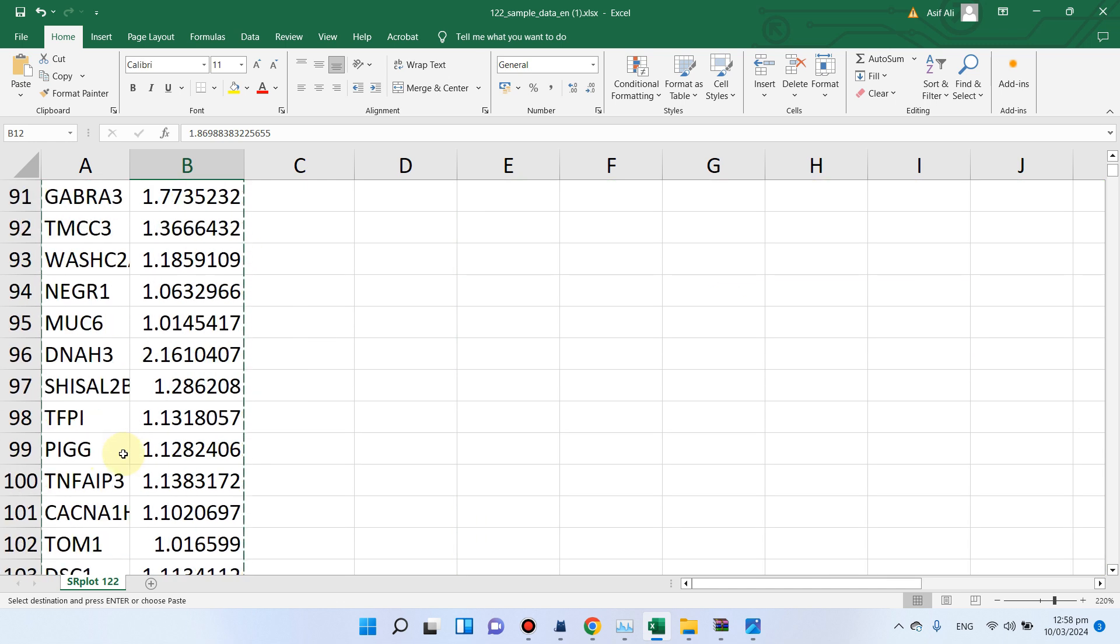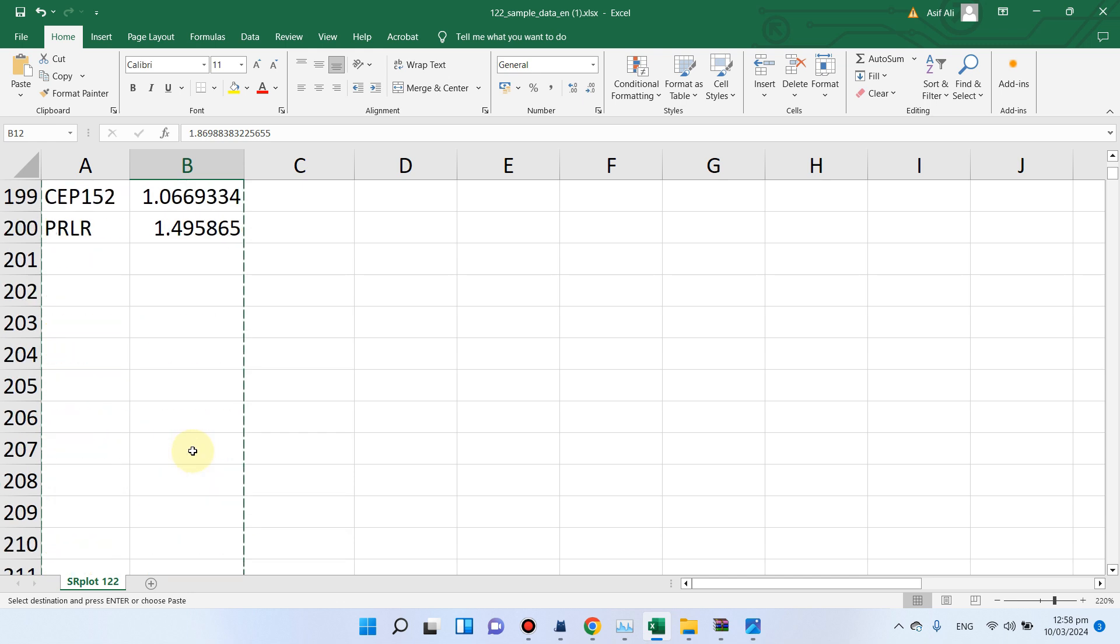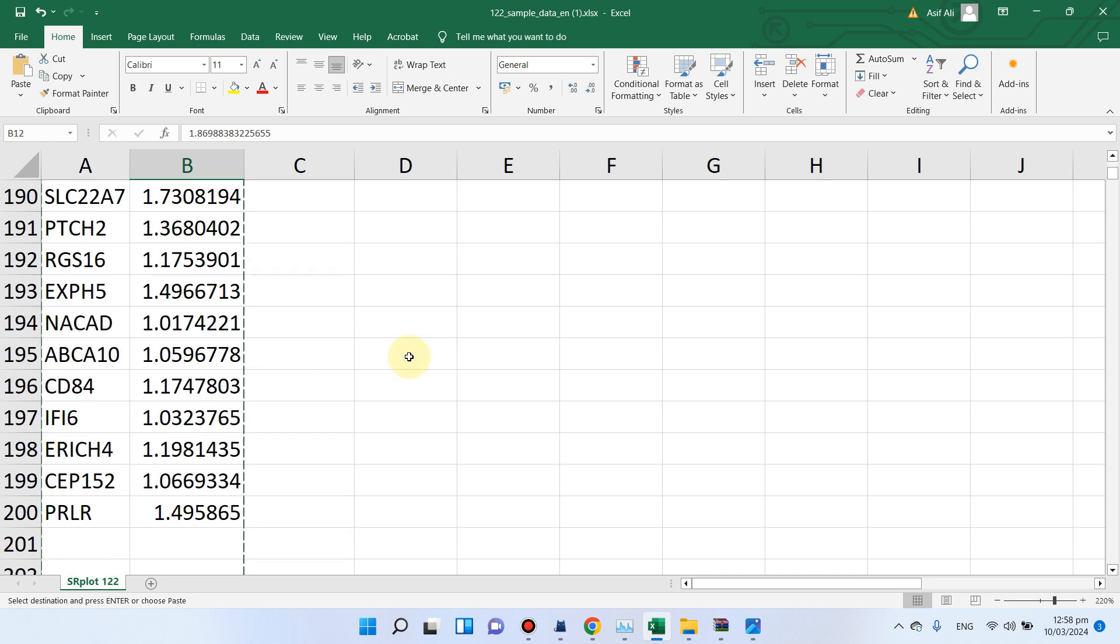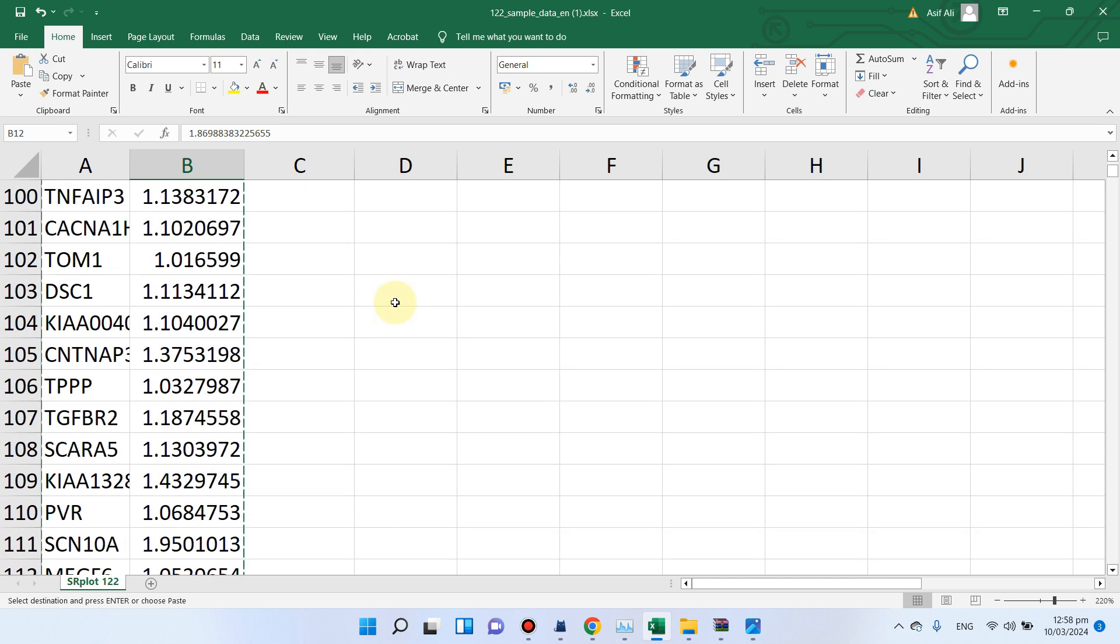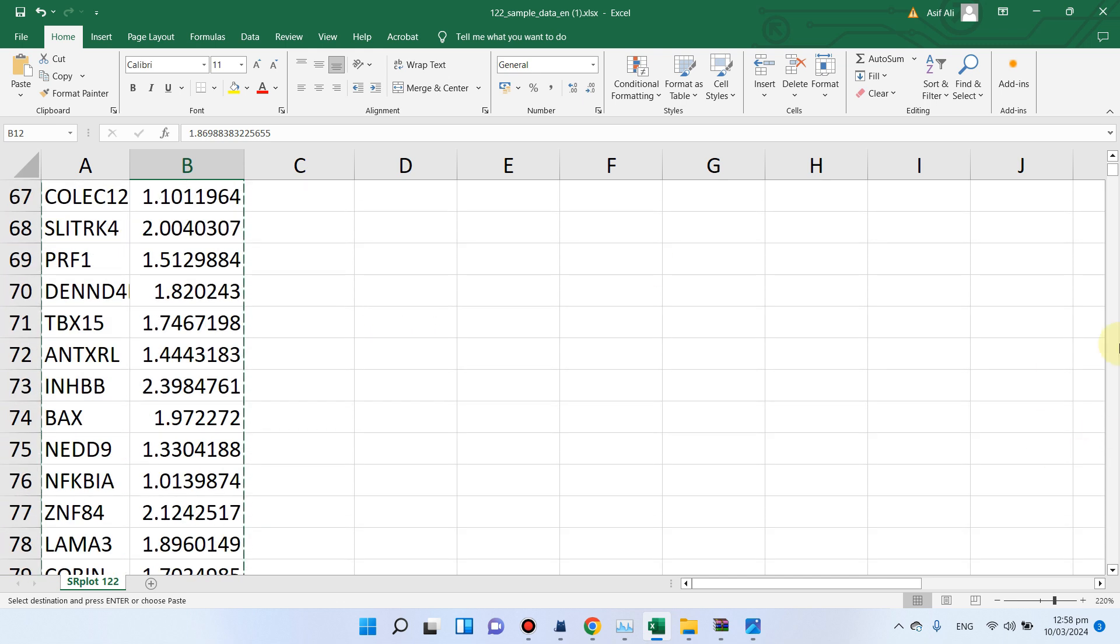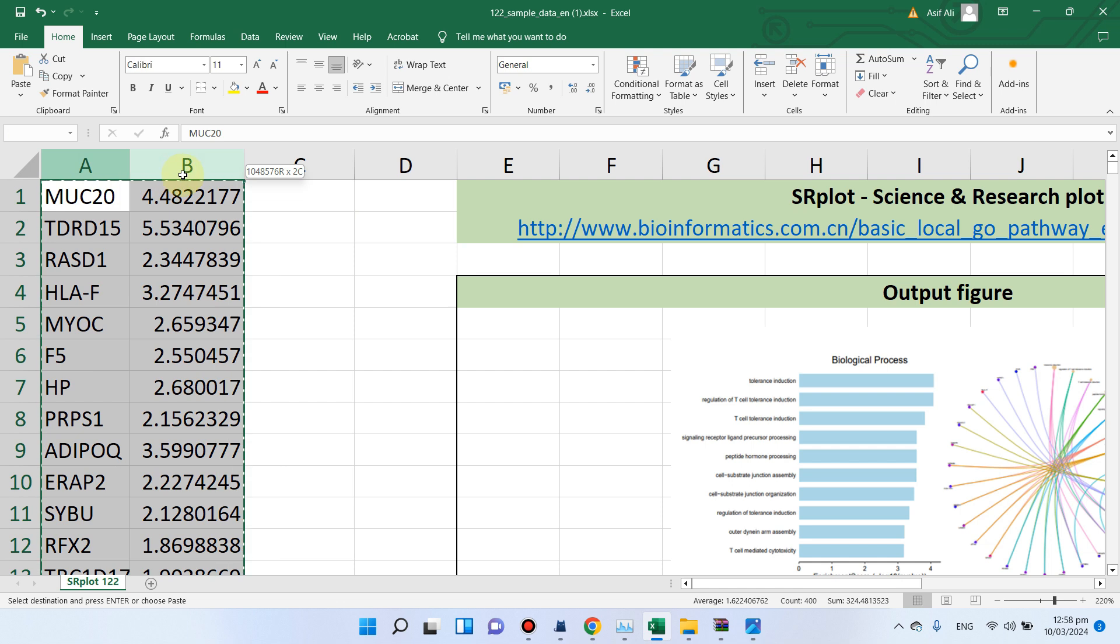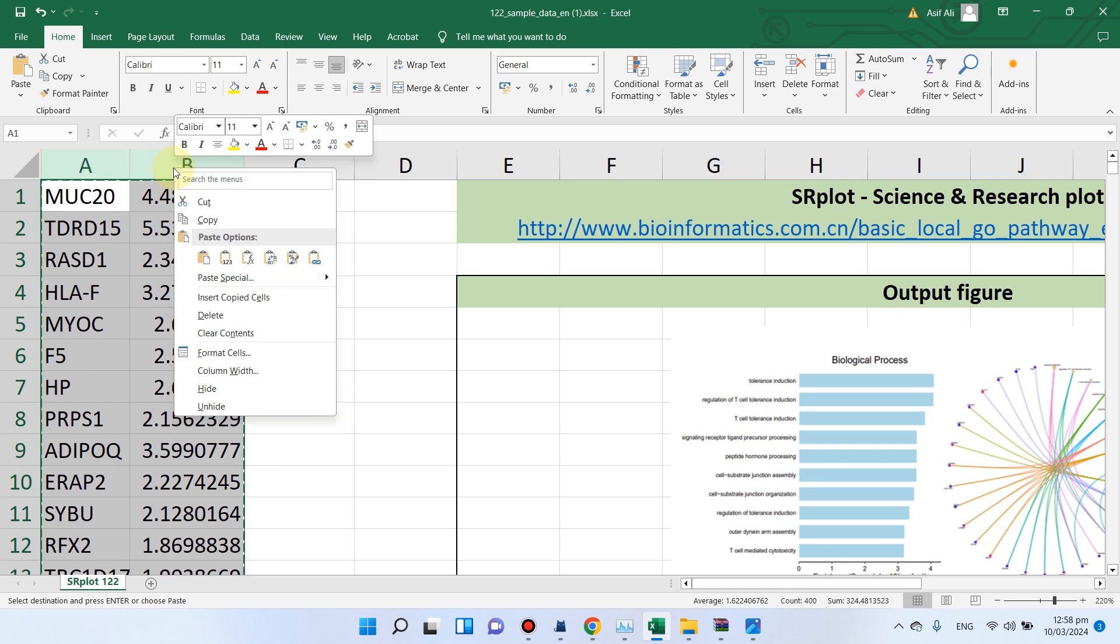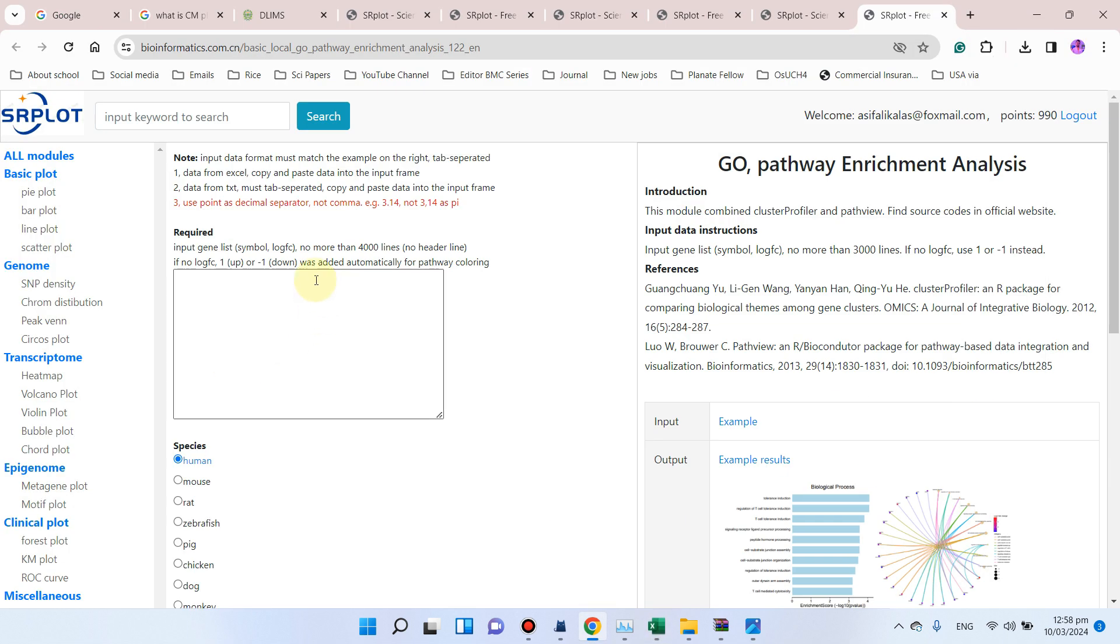So after you have pasted all your gene IDs along with their log FC value, you can simply copy all this information. And you can also notice that there is no header in this case, so we can simply paste here.